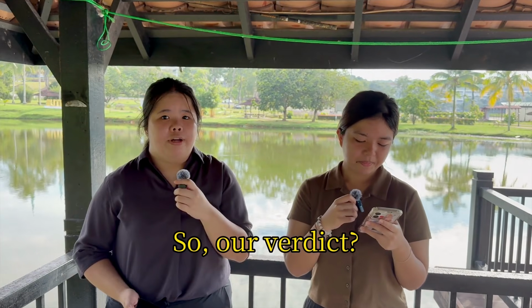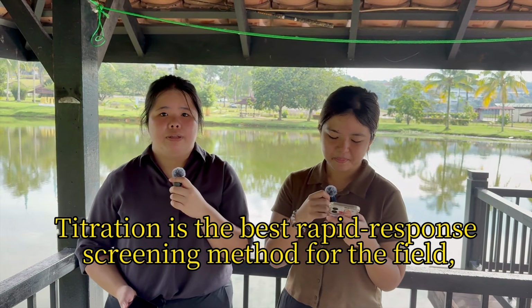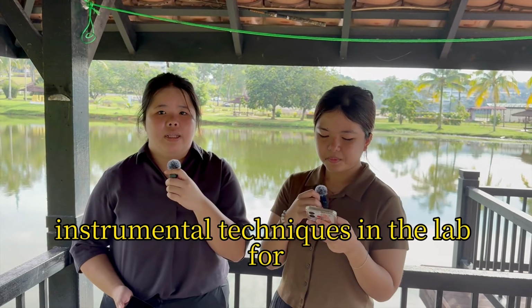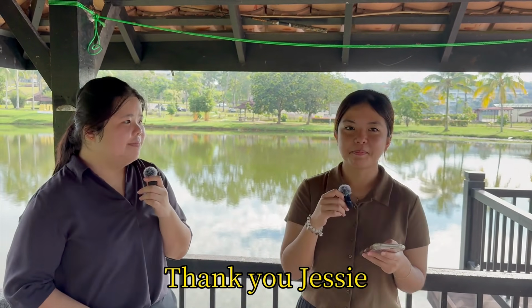So, our verdict: titration is the best rapid response screening method for the field, but we must justify using instrumental techniques in the lab for the final court evidence. Thank you, JESSIE.